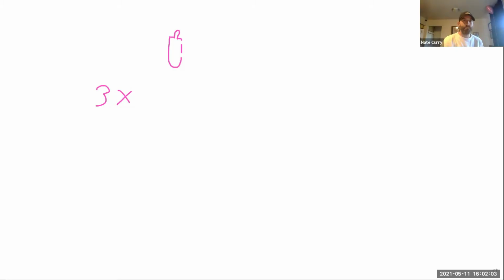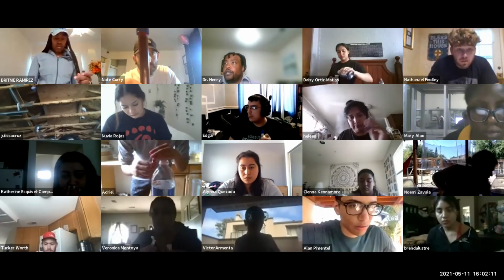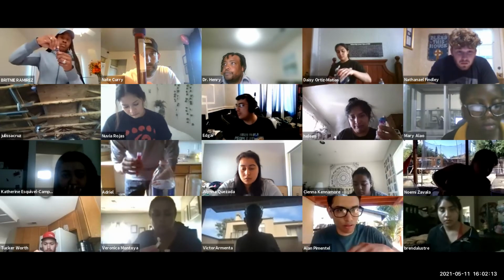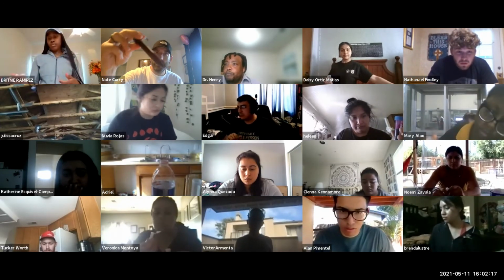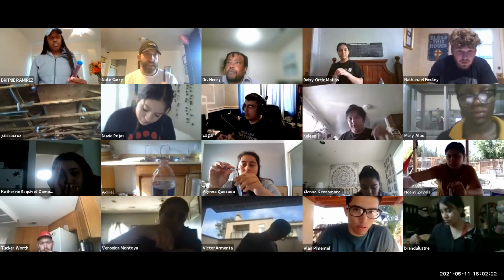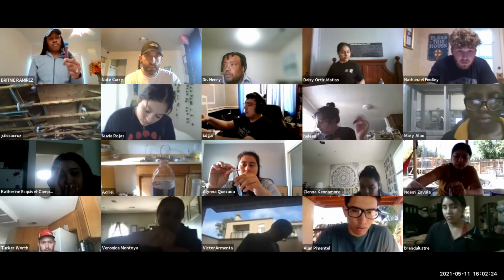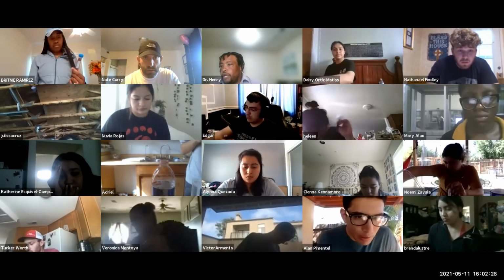All right, this is dark blood red right here. Okay, I get you. So did you record the color? Dark blood red. Perfect. What about yours, a pH strip or just the color? No, the color's perfect because it's an indicator. I'm gonna put on the screen what it should look like.